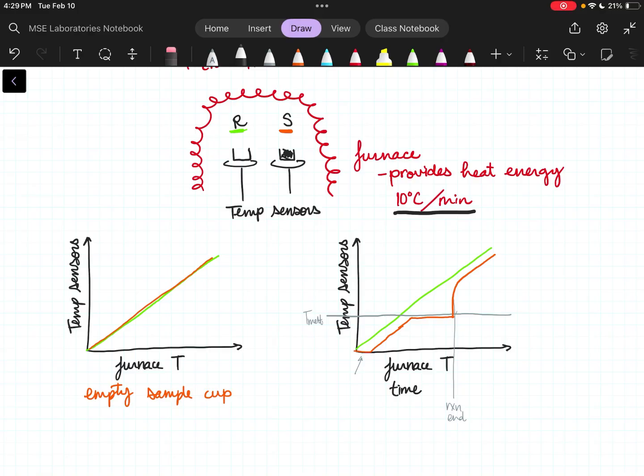That's not particularly hard to make. But what I have, from here to there, is the time, how long it took for that reaction to occur. I also can get a bit of information from when the reaction ends to when it rejoins the temperature slope.